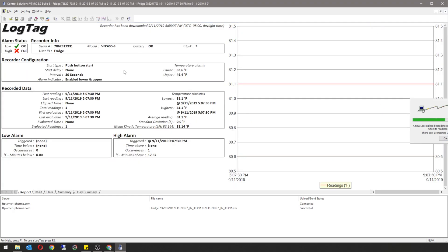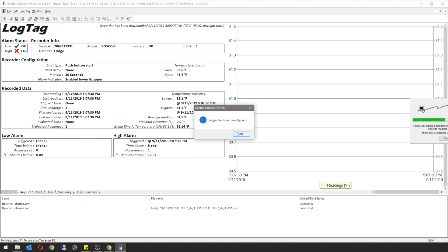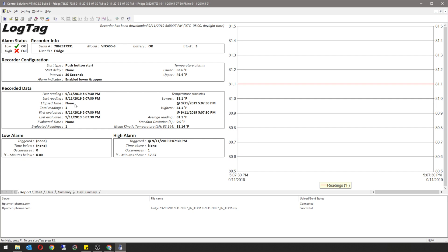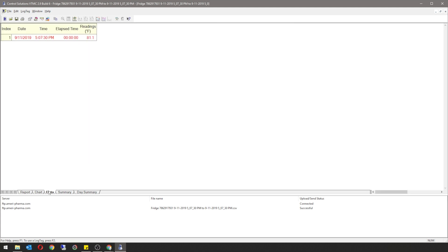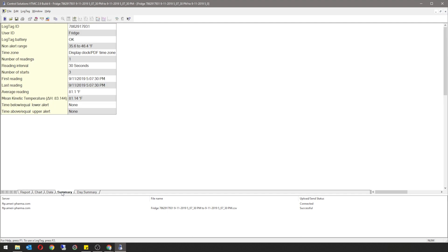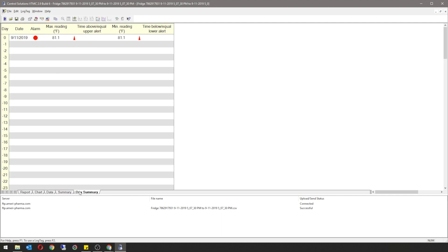This is the screen of the data that you'll see. Your logger will also be reconfigured, so press OK. Once the data has come up, you'll see that it's automatically under the report tab. You'll also have the chart tab that will show you a graph, the data tab that will show you the raw data, summary that will show you a summary of the entire span that it was recording, and day summary to show you each day that it recorded.